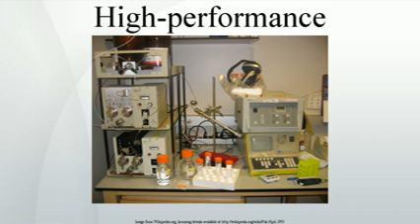Types of ion exchangers include polystyrene resins. These allow cross-linkage which increases the stability of the chain. Higher cross-linkage reduces swelling, which increases the equilibration time and ultimately improves selectivity. Cellulose and dextran ion exchangers, gels, possess larger pore sizes and low charge densities, making them suitable for protein separation. Controlled pore glass or porous silica.